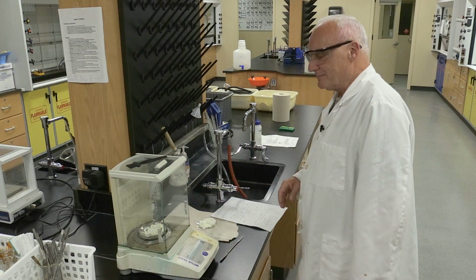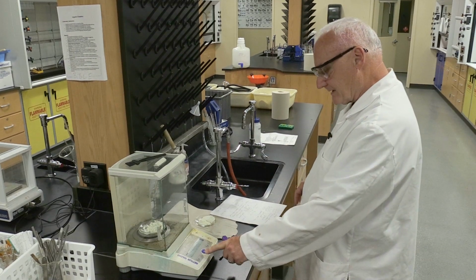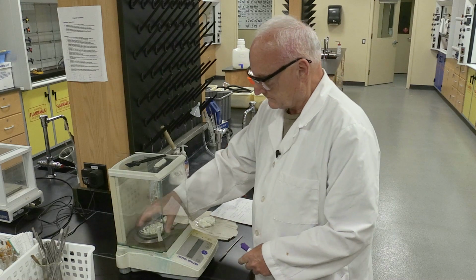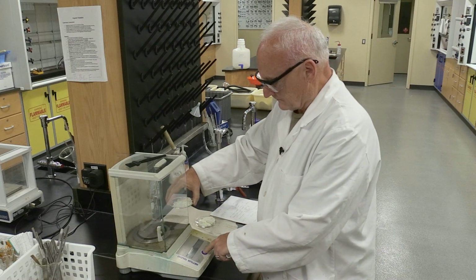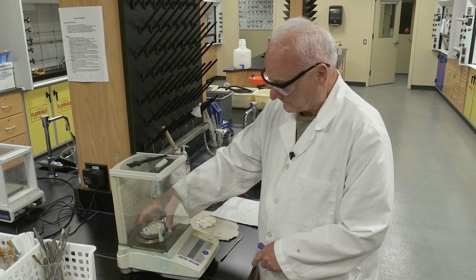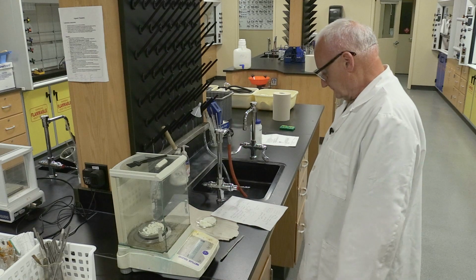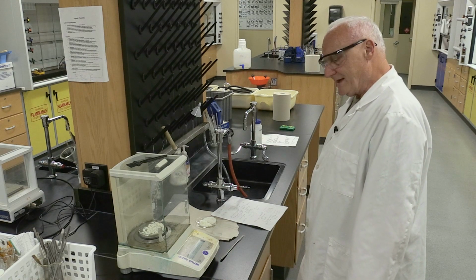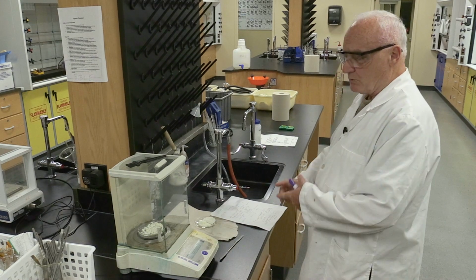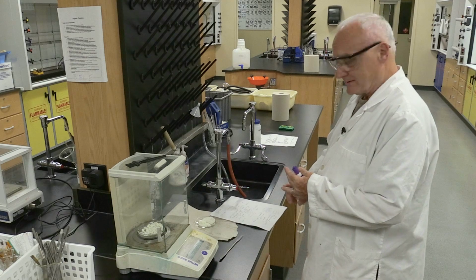Now, part B was removed from the oven, and we have a mass of 48.3805 grams. That's the weight of the watch glass, plus the filter paper, plus the product.